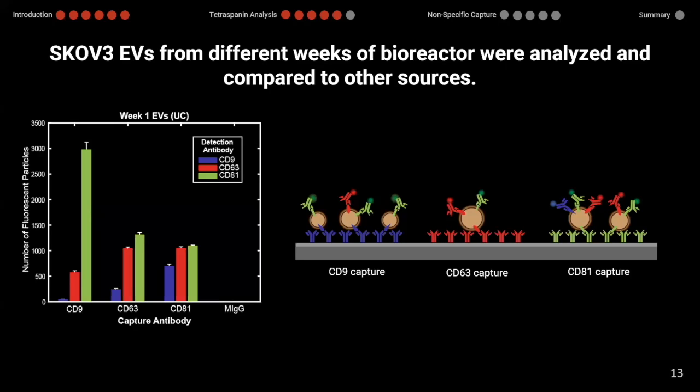Hi, I have one more data analysis question. Why don't you have the negative control signal in your graph from ExoView? It's quite unusual. Is it because of secondary analysis, or is the raw data from ExoView? So this is secondary analysis. The way I chose my limit of detection to say, yes, this is an actual particle, was looking at our negative control, the mouse immunoglobulin control. And I said, I don't want to see more than about 10 total of what the machine quantified as particles.